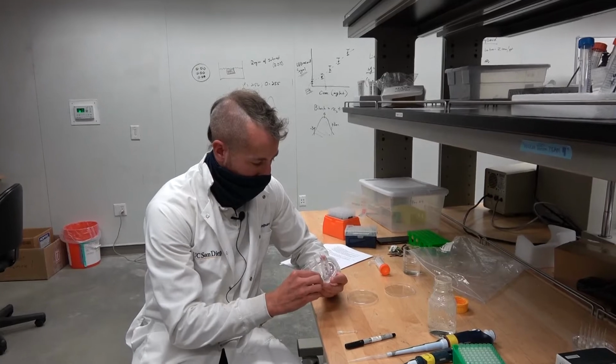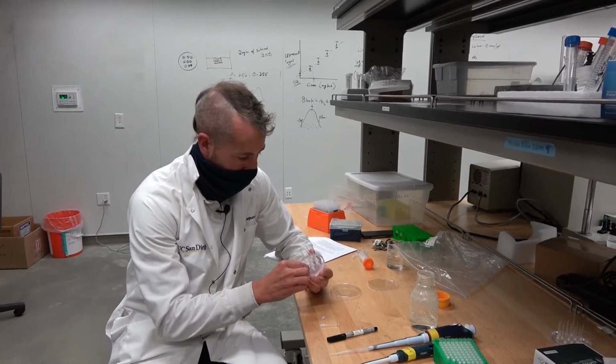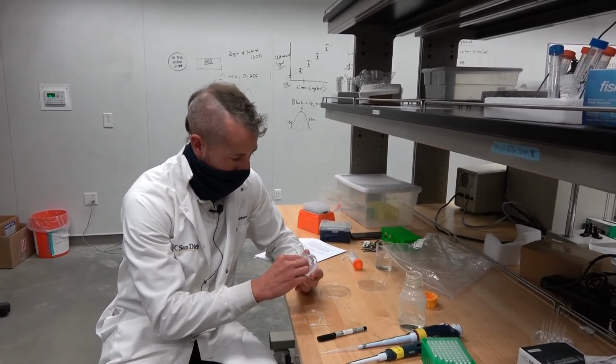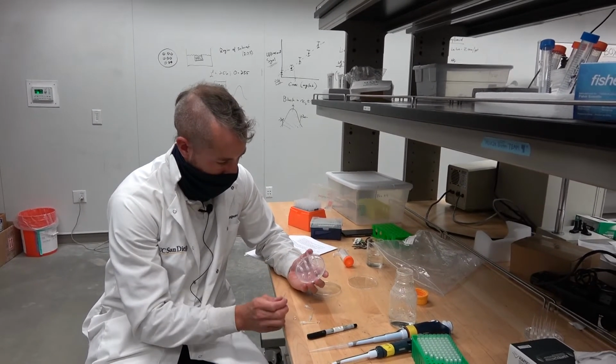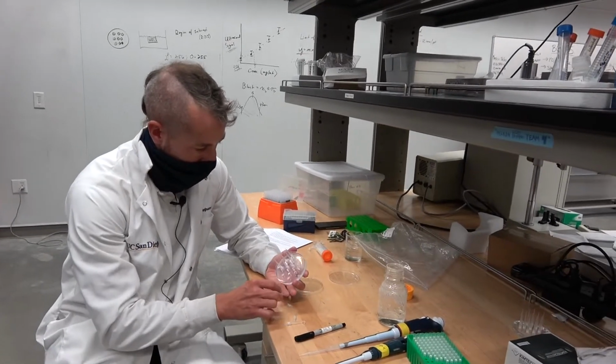So fast forward to removing all of these. Sometimes it comes out right away. Other times you kind of have to poke it.